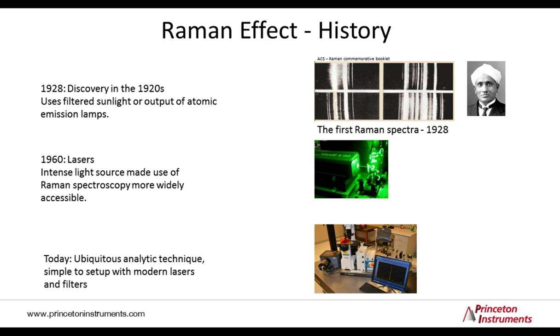A big game changer was the invention of the laser in 1960, and that made Raman spectroscopy really more widely accessible. Mainly the higher energy densities, and thus increased Raman scattered photons, made them more easily observable. Today, laser excitation covers a wide range from the UV to the IR, and all of these wavelengths are used to excite Raman processes. Also today, Raman spectroscopy is a widely used analytic technique. It's fairly easy to set up, with a vast amount of applications in scientific research and industrial processes.